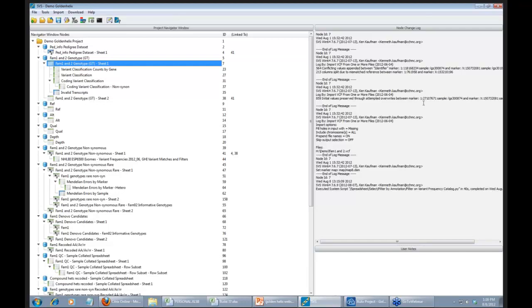Okay. Another question. Is the software applicable for larger case control studies? Yes. We can handle massive amounts of data, and that also correlates well with another question about handling full genome sequence data. We can handle that too. Can you analyze paired normal tumor seq data for somatic mutations and apply similar filters? Ken, do you want to comment on that at all? I've got a little bit to say, but I'd like to hear what you think.